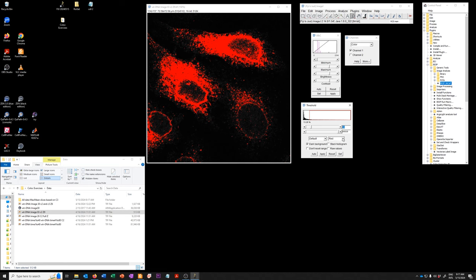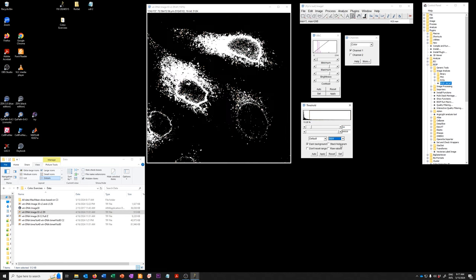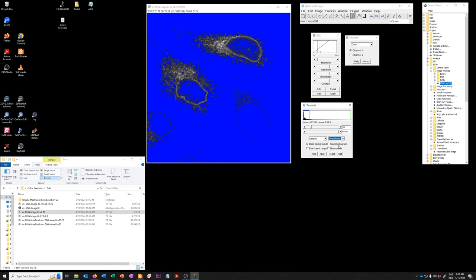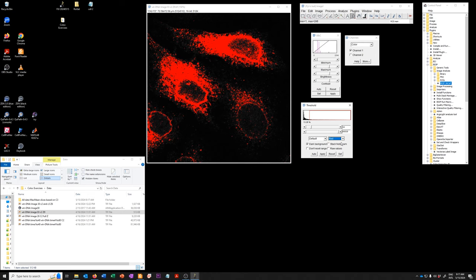If you change this red to black and white it will show the thresholded pixels. So the pixels that are above the intensity of 34 in black and white. If you do it in over under it will show you pixels below 34 as blue and the ones above them in whichever display lookup table you had selected for your image. So I'm going to leave it on the red.